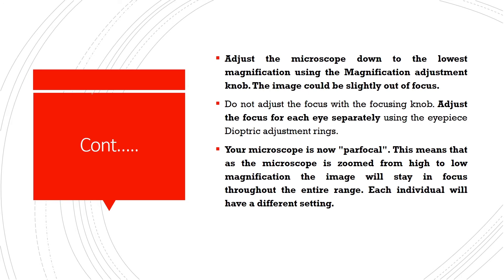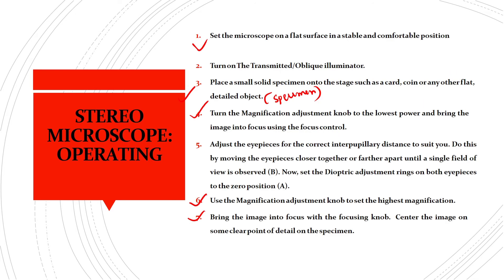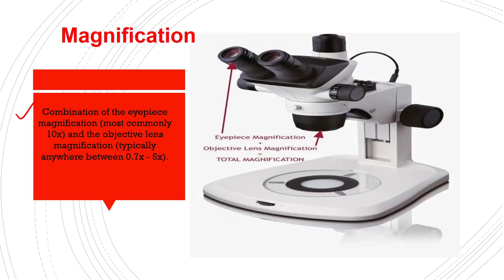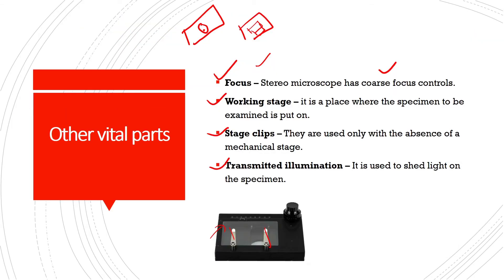Your microscope is now parafocal, meaning that as it is zoomed from high to low magnification, the image will stay in focus throughout. Each individual can set their own settings using the diopter adjustment ring according to their own eye power.